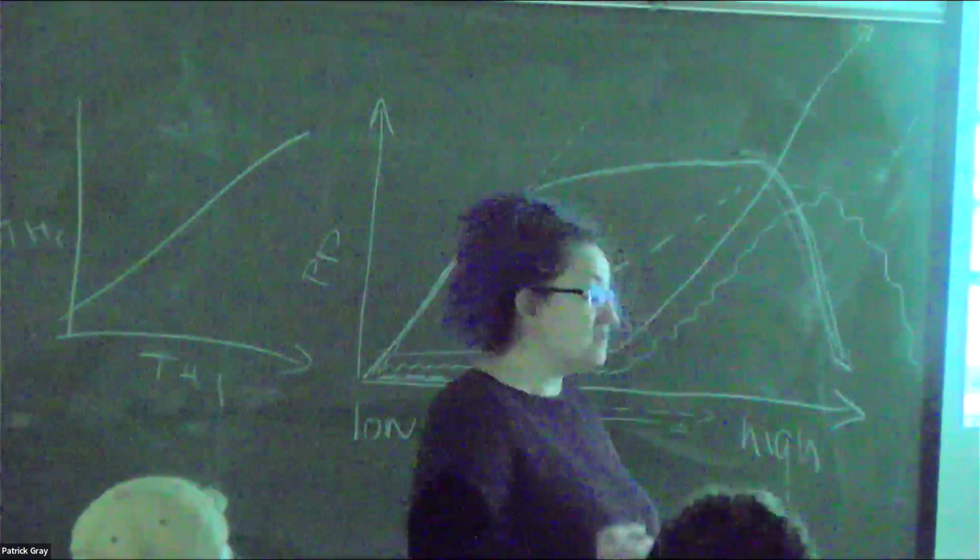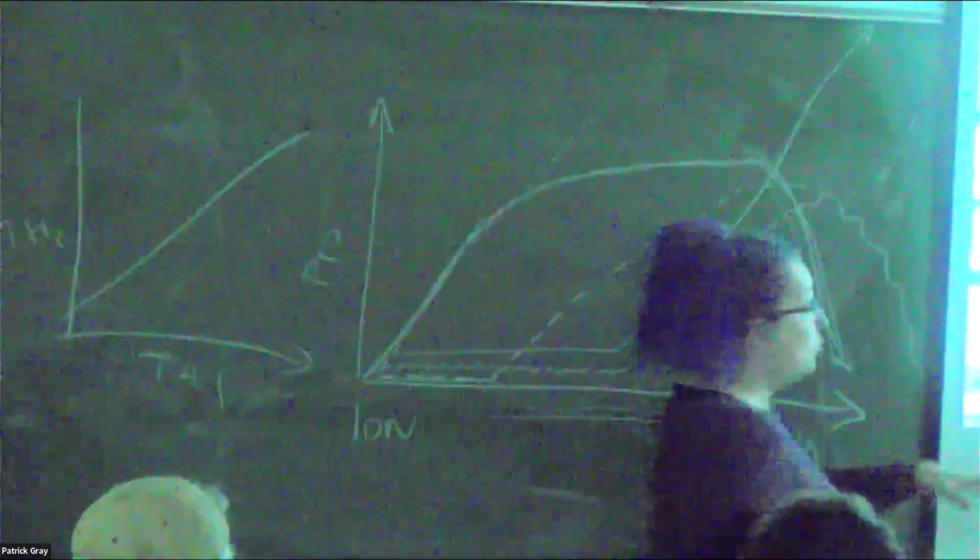Because of those other pigments, and the light sensitivity and nutrients and all these other things, when you compare your calibration from the factory, which is how much chlorophyll per chlorophyll fluorescence you measure from your in situ instrument, and you do that calibration in the lab with many different cultures, you're getting these insane relationships.